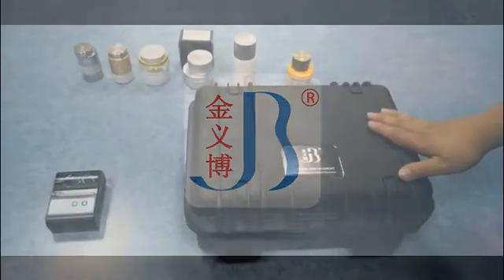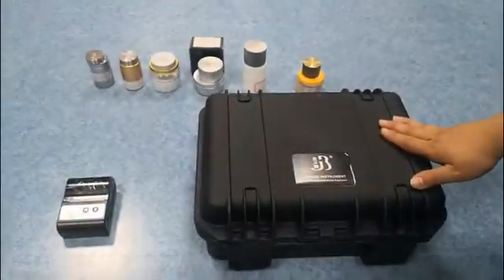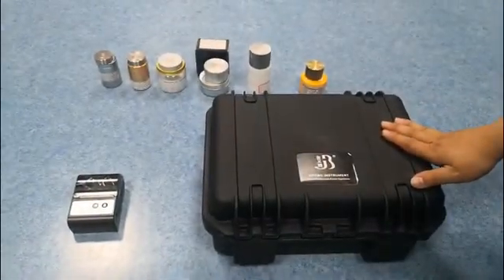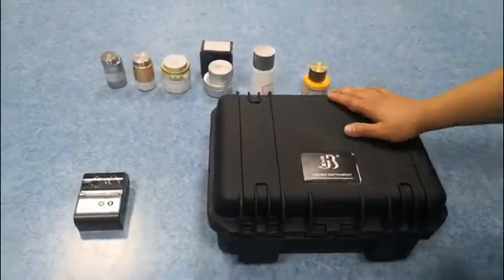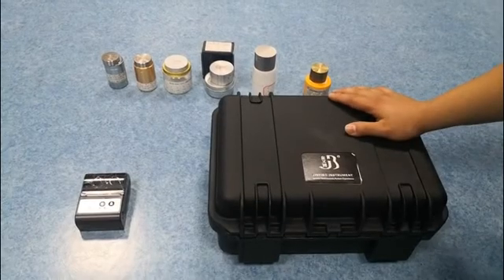In this video, we will show you our laser metal analyzer.